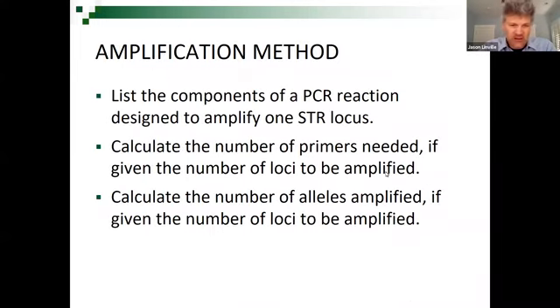This is CJ352, just another mini lecture on amplification method. What does that mean? What we're going to do in this shorter video is I want you to be able to list the components of the PCR reaction. Well, wait a minute, can't I already do that, Dr. Linville? Isn't that the only thing you want us to know from the PCR lecture? You're correct. But now I just want you to be a little bit more specific for if we're amplifying STRs. Okay, what do we put into the tube? So I'm just going to ask you to describe the primers, DNA, polymerase, dNTPs, maybe a little bit more closely.